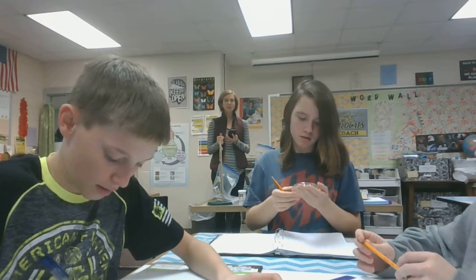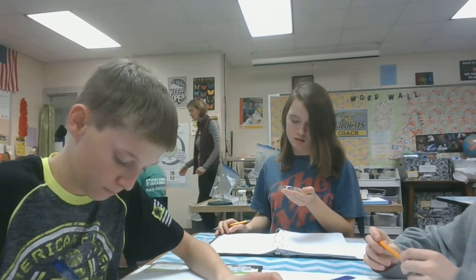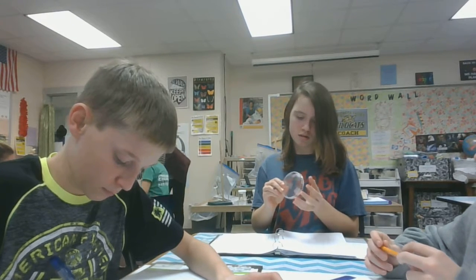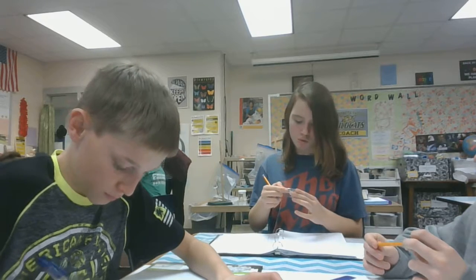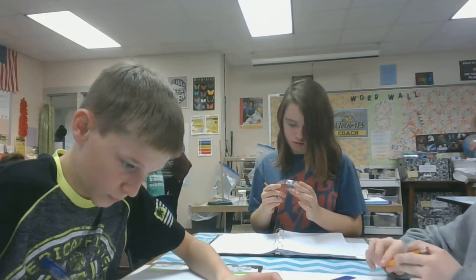When you're looking at their belly side and drawing, see if you can identify their mouth. Alright, show me how this works. Whoa, I see the mouth.